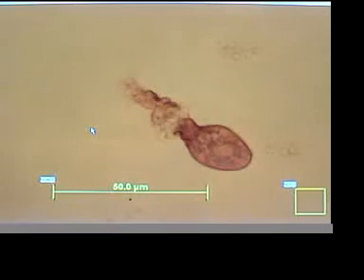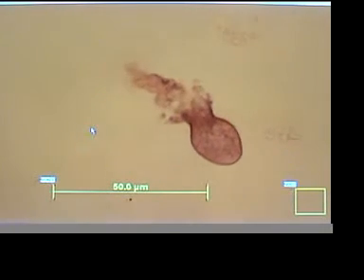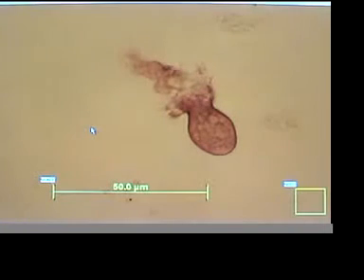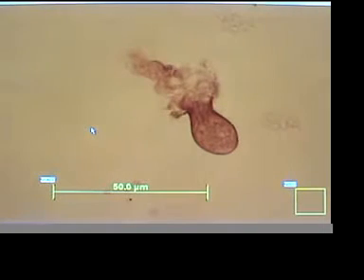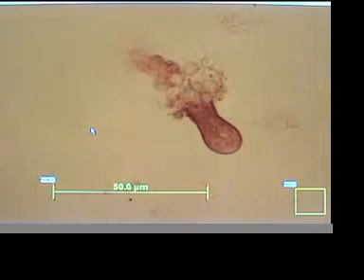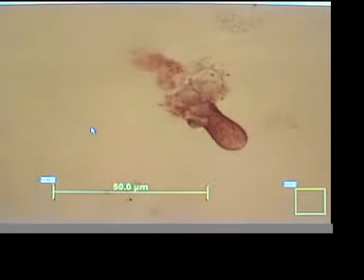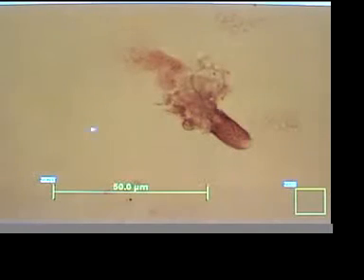And we have a hit. This is live in real time. Dramatic devitalization. I'm not going to center the slide so that you can see it.